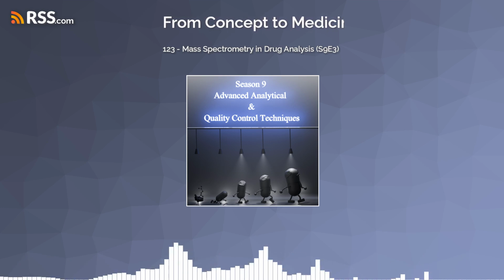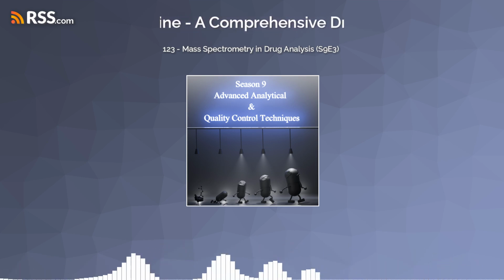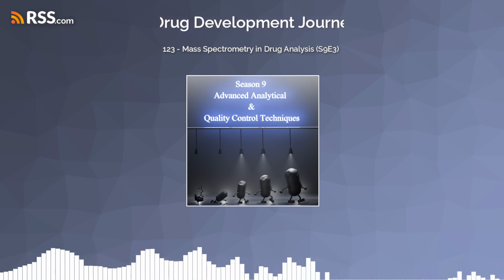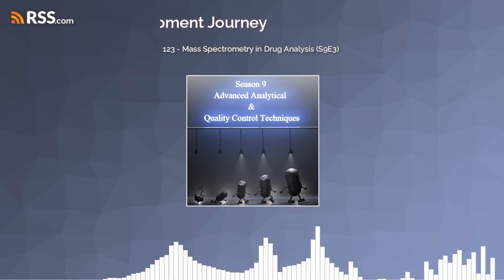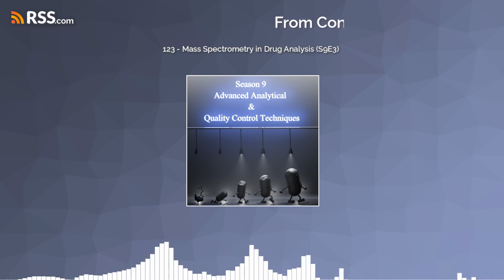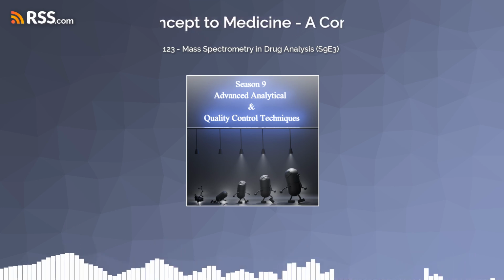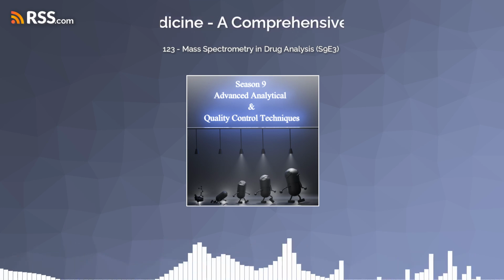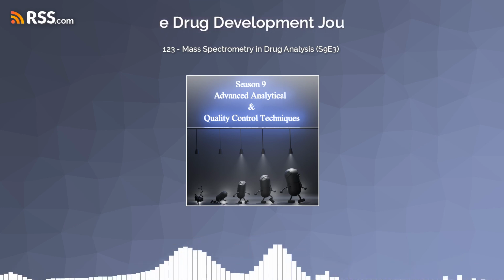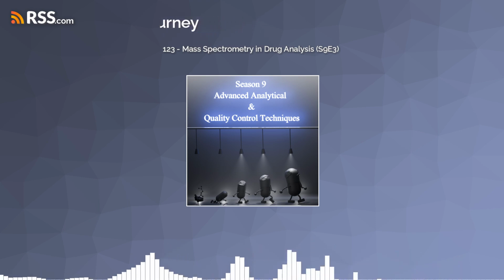And a really important part of this detective work is figuring out what impurities might be lurking within a drug. Because even a tiny bit of something extra could change things up, right? Absolutely. Even in very small amounts, these impurities, which can come up during the drug's creation or even during storage, can impact how safe and how effective a drug is. And I'm guessing that's where mass spectrometry comes in. Right. It's super sensitive, so we can use it to find even those tiny amounts of potentially risky substances that are hidden within a drug, like searching for a single off-key note in a whole symphony.